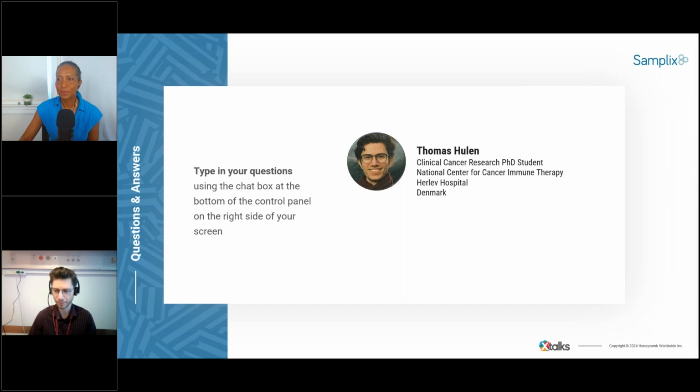Yes, so the production of the droplets is the same every time. It is standard reagents provided by Samplix, but outside of that, you can integrate pretty much any commercially available stainings or reagents you want to do. So if you want to stain for particular markers, or whether you want to have some other reagent like the granzyme B reagent, which is not an antibody marker, you can buy these commercially, but they will be used all with the same kit to produce the cells.